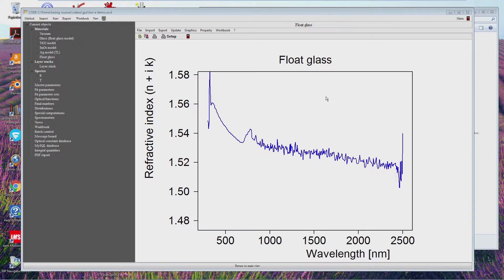This is the real part of the refractive index in detail. You can see that the optical constants determined automatically contain all the noise of the measured data. You can say that's the price we have to pay, and sometimes you can just do it and not care about these not-really-nice features of the optical constants. But if you want to do something nicer, you have to use a real model and adapt model parameters.